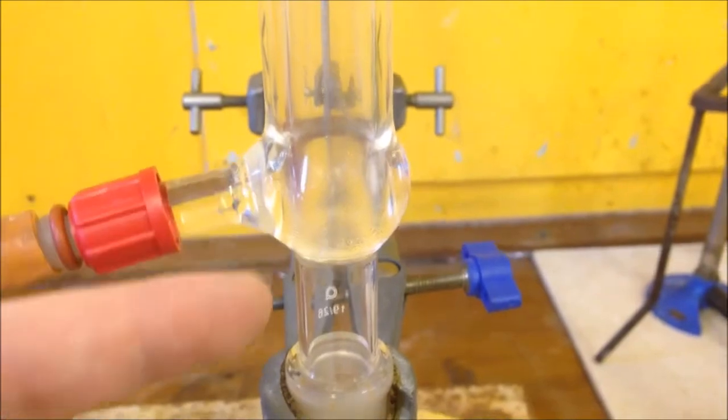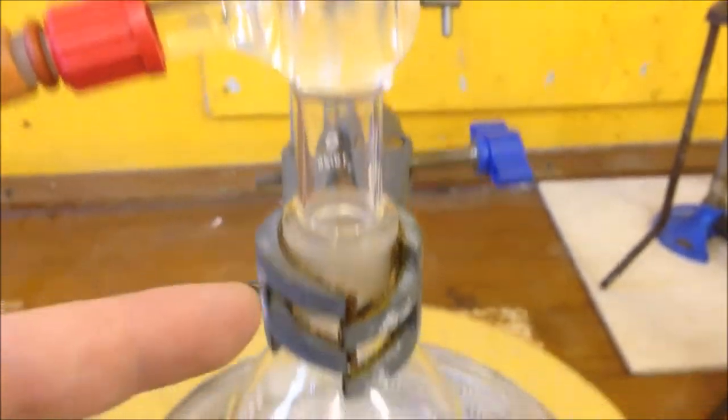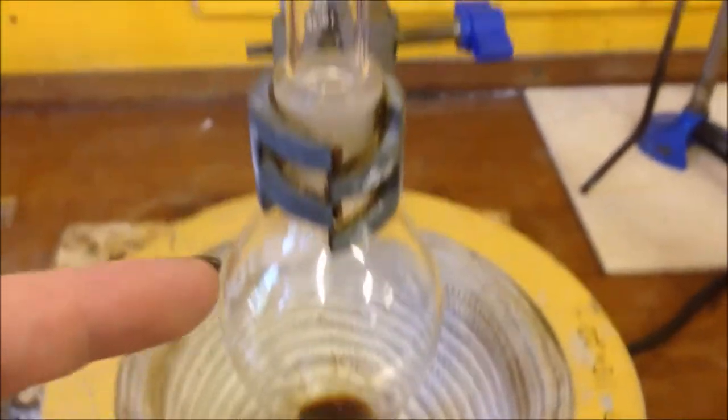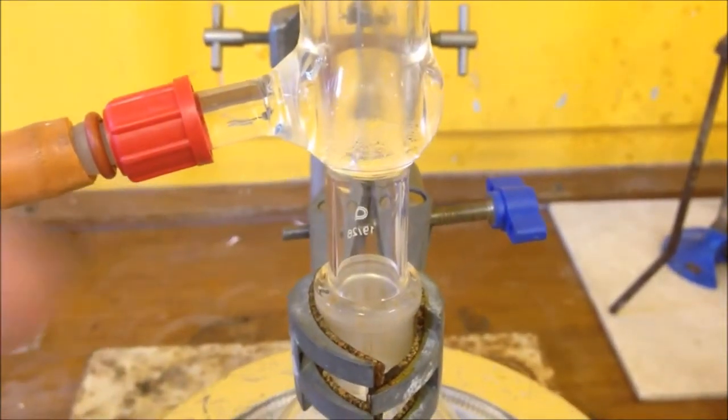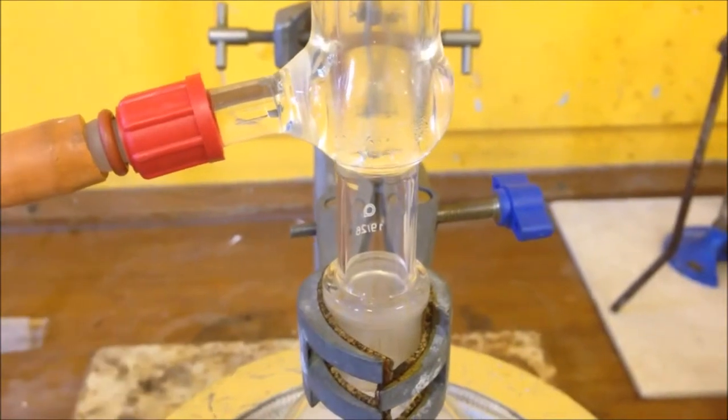You can see the condensation forming here and it's dripping back down again into the flask where it's being reboiled. So this is what's happening in reflux: things get boiled, condensed, boiled and condensed over and over again.